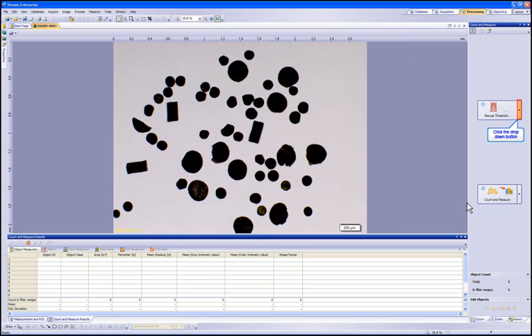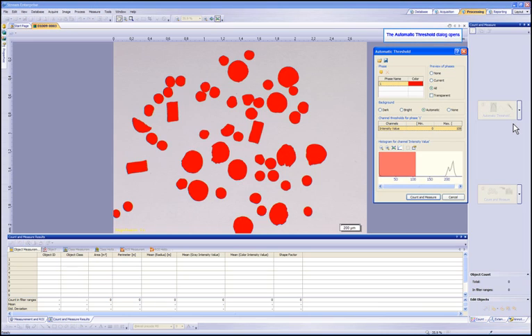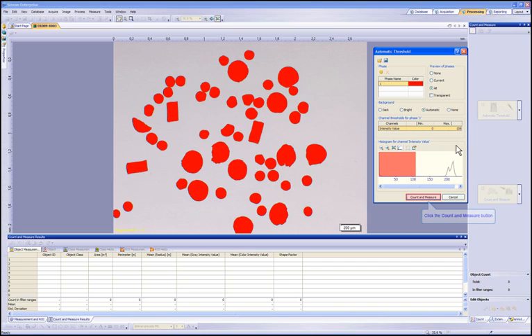Again, select the drop-down to choose the automatic threshold mode. Since automatic mode works very well on this colored image to detect the threshold of each particle, we can now simply select Count and Measure to perform the particle counting.